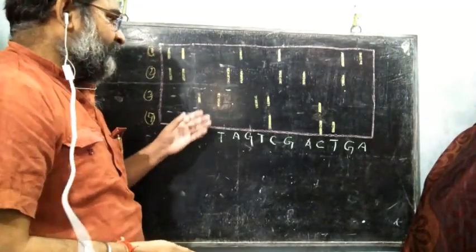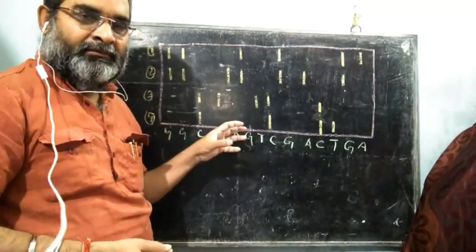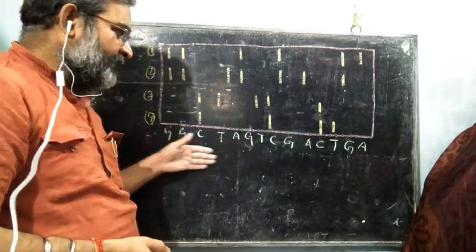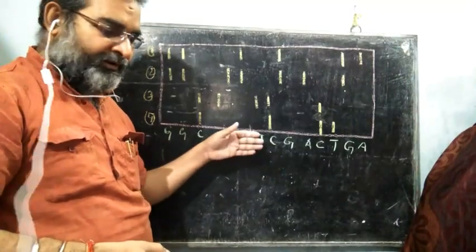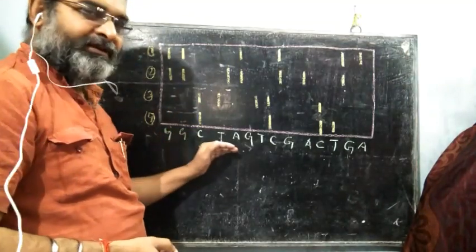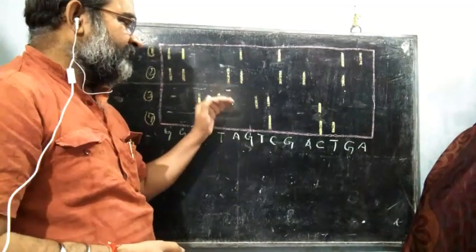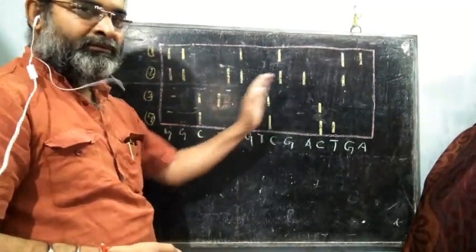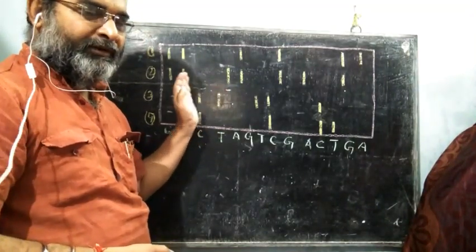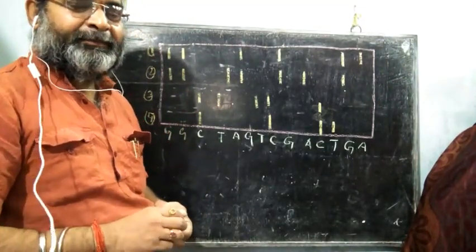In this way, we can analyze the banding nature and the corresponding DNA sequence, because we analyze the DNA sequence by the spotted structures of the bands dispersed throughout the electrophoretic field. It is referred to as wandering spot analysis.